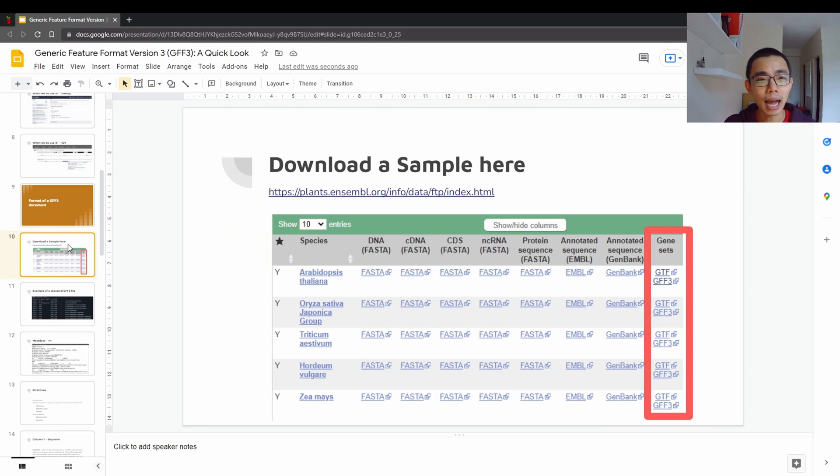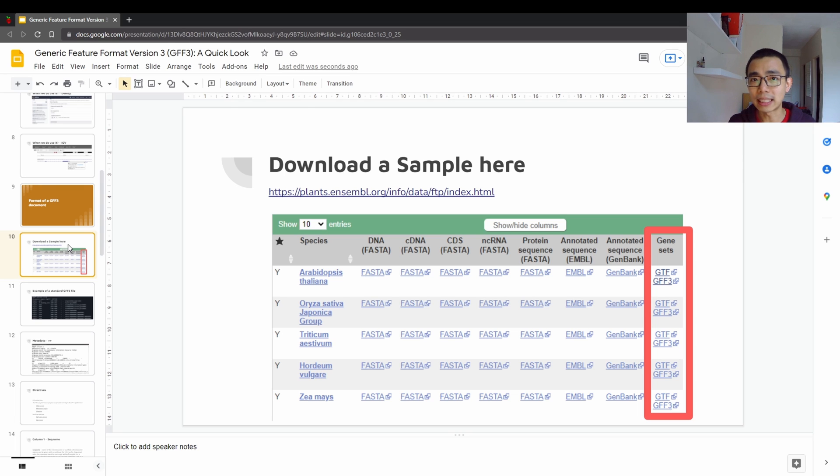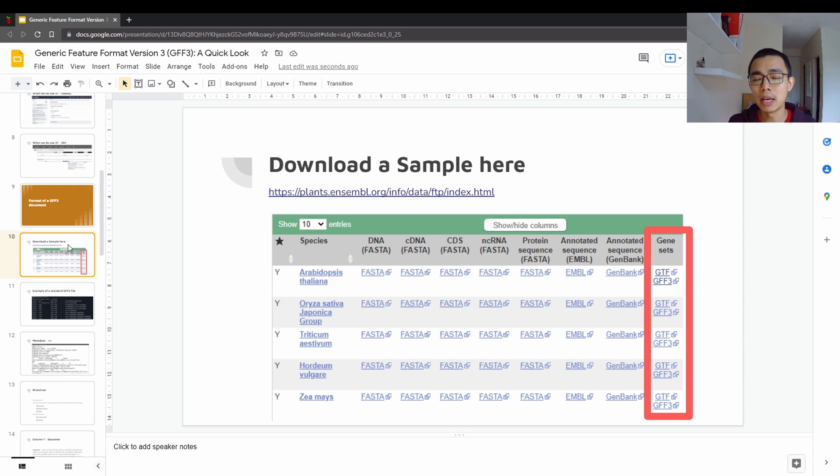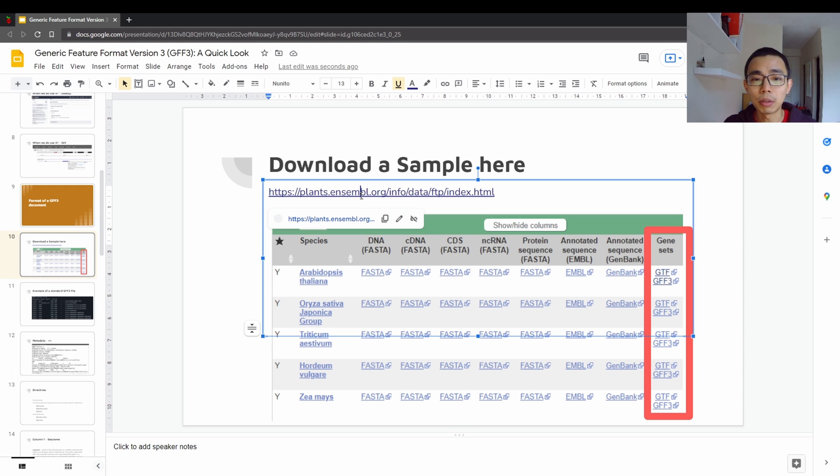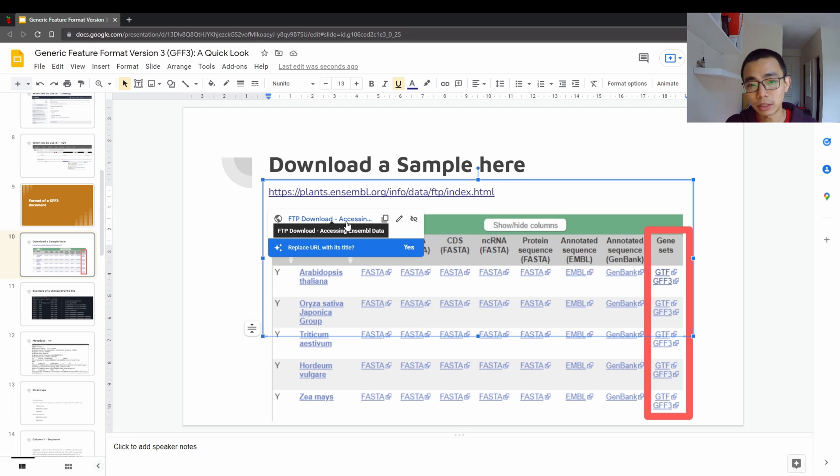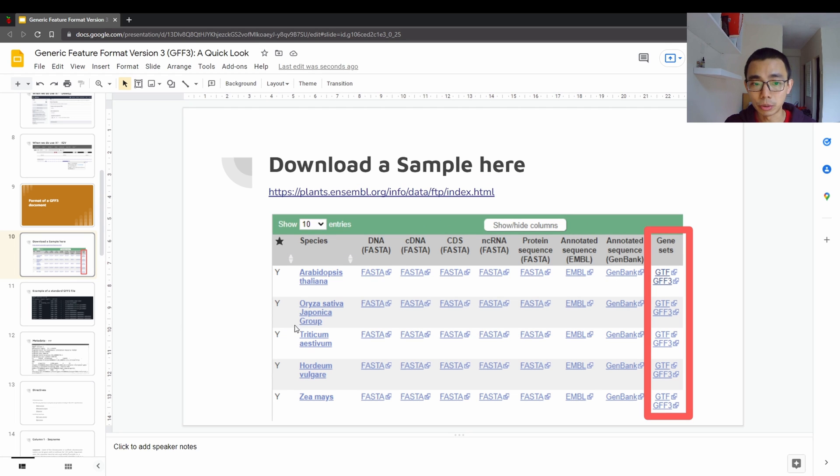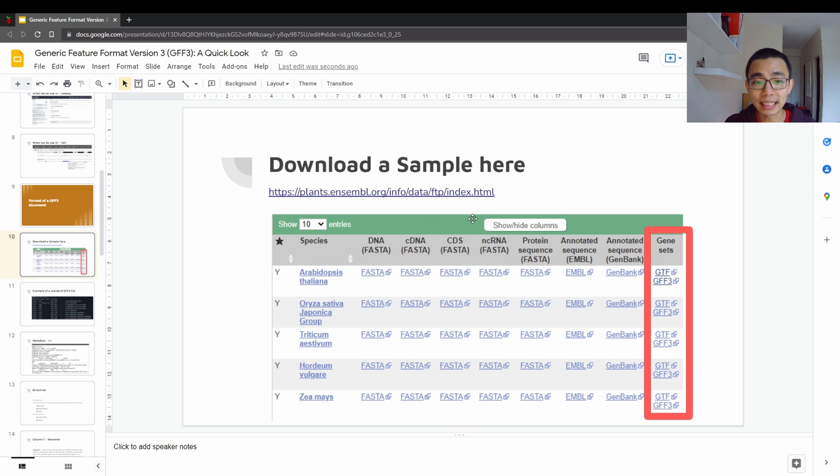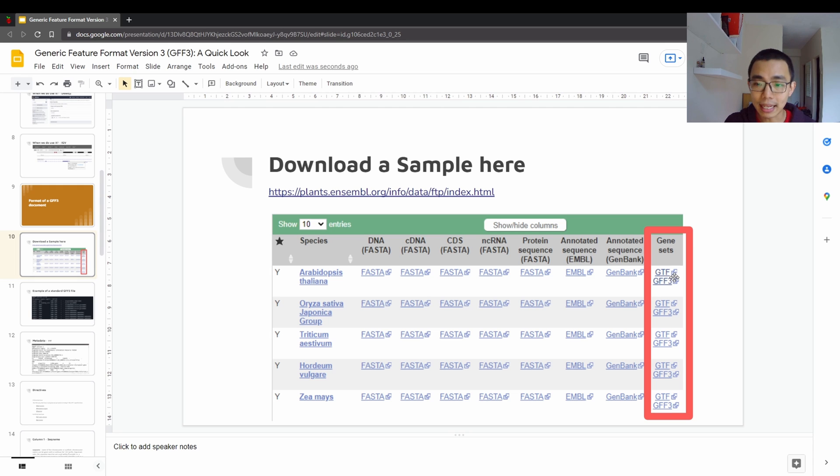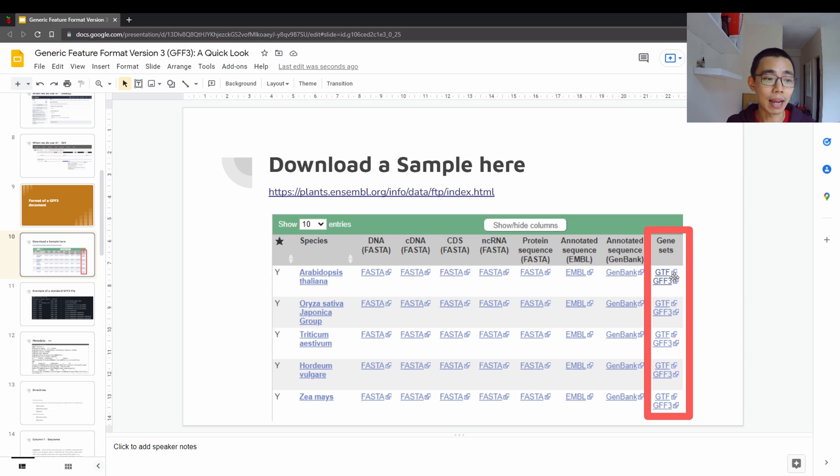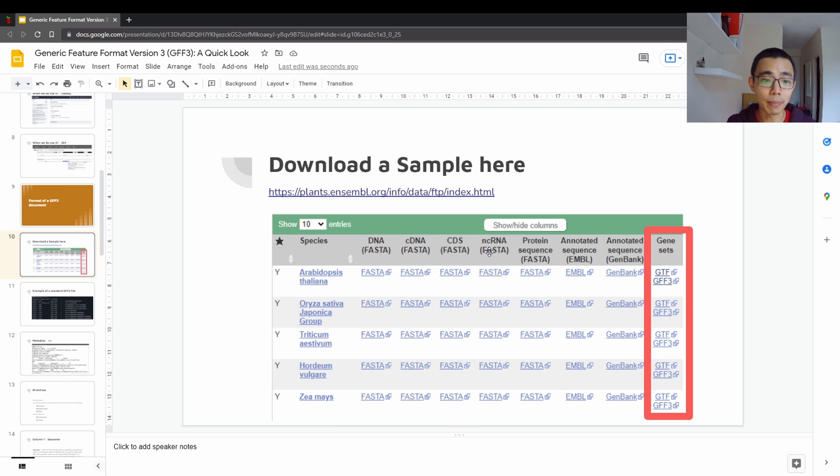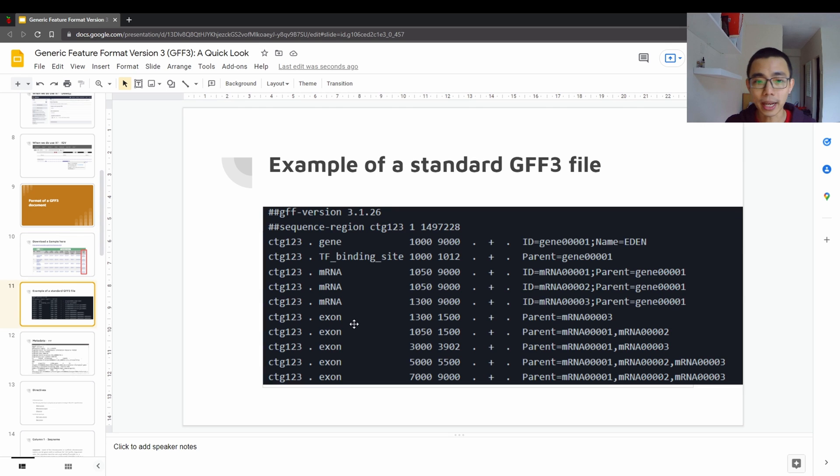So the next one will be how they are represented. The easiest way to actually understand the GFF file is to download one yourself, an actual one, not a dummy one. So you can actually go into Ensembl.org and once you go into the FTP download, you scroll down the website, it should bring you to this table. Once you reach this table, just look for GeneSet GTF or GFF3 and then download the GFF3 file. It will bring you to another FTP and you can download the smallest version that you can have. So I will recommend Arabidopsis and try to download chromosome 1 so that it's easier for your understanding.